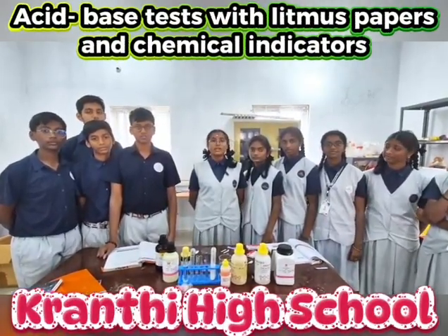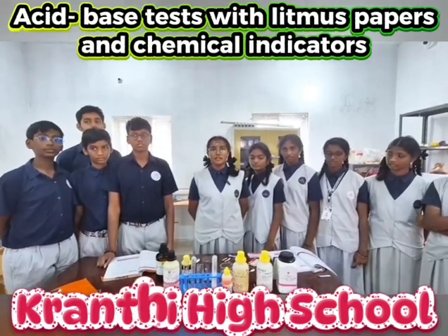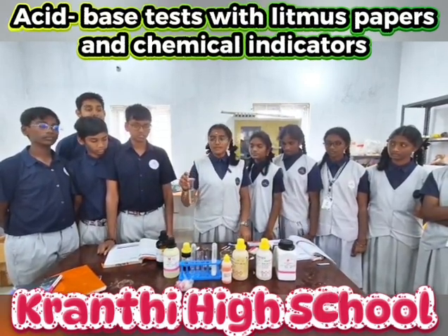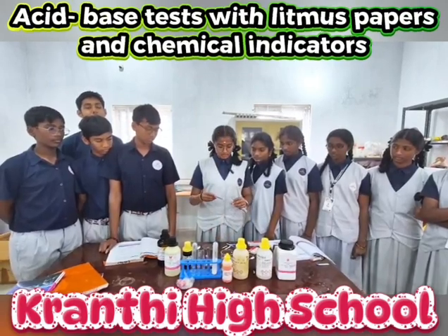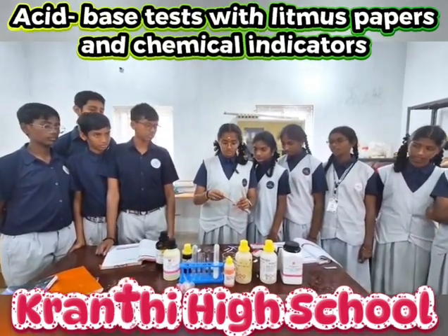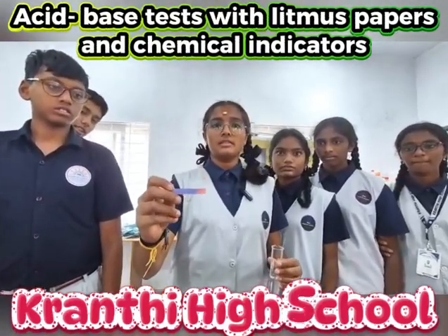Today we are doing an experiment, chemical properties of acids and bases by using laboratory indicators. First we have to take diluted sulfuric acid. First we have to dip blue litmus paper into it. As you see, that blue litmus paper has turned into red.